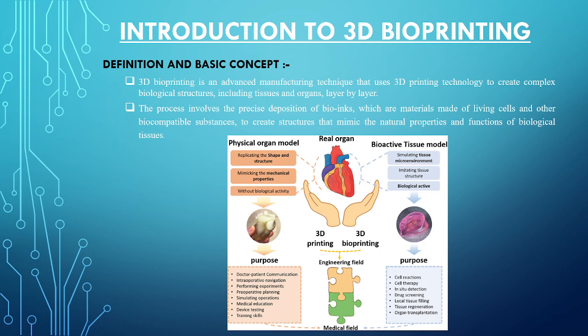Whenever you have the possibility to look at how 3D printers print a structure, it prints layer by layer, right? It is not a magic show where it suddenly closes something and suddenly shows the entire thing, right? You can see layer by layer, structure by structure, it constructs the 3D model, whatever we provide as the order, right?